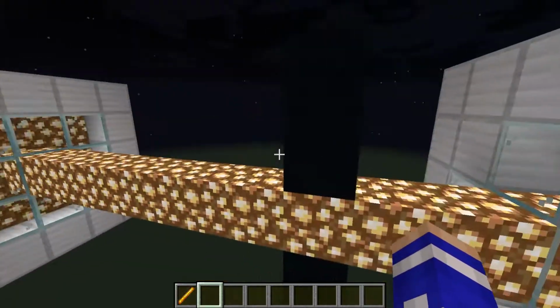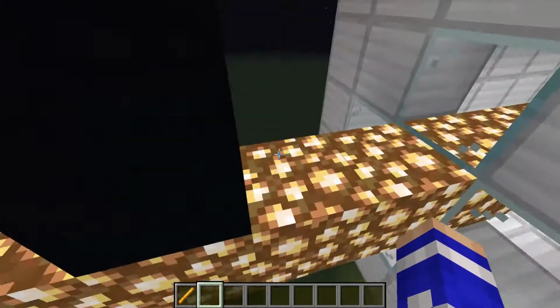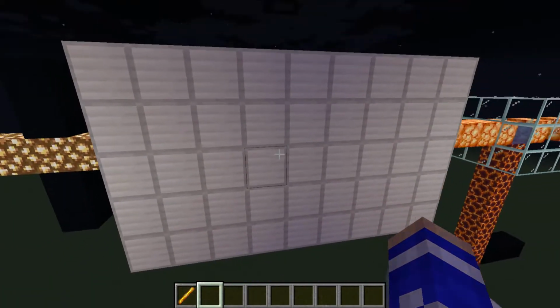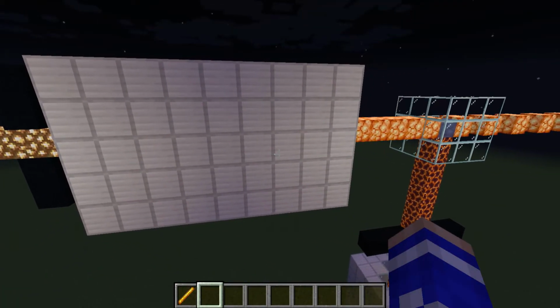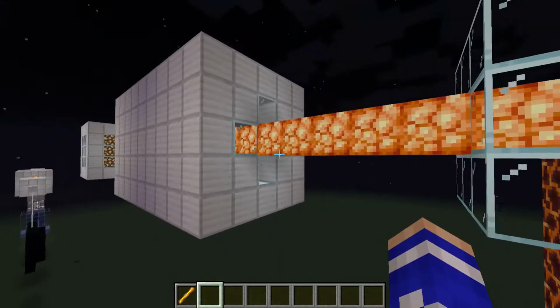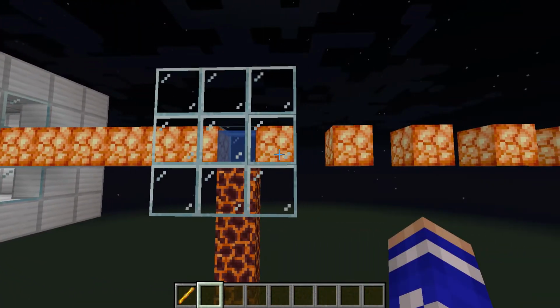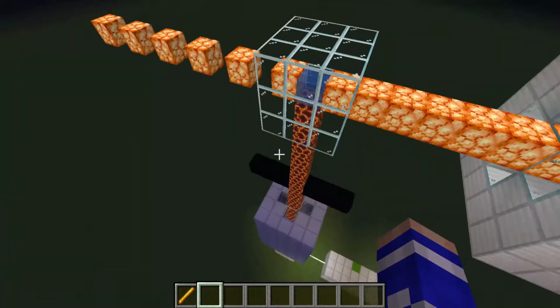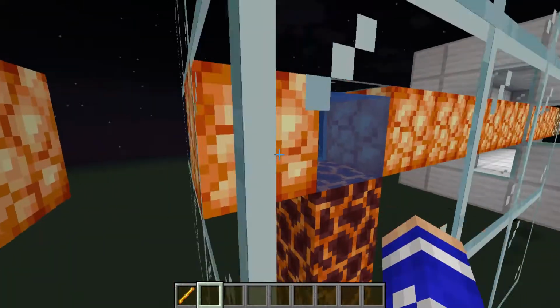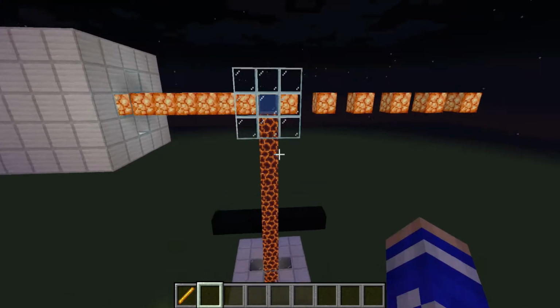It's going to pass through a slit, so only a certain amount of light can get through. This is going to go into a specifically excitation monochromator, and this is just going to excite the light, and that excited light is going to go into our sample cuvette. So what's different about this one is that we're passing light directly through the sample fluid itself, rather than like burning it or turning it into flame or anything like that.